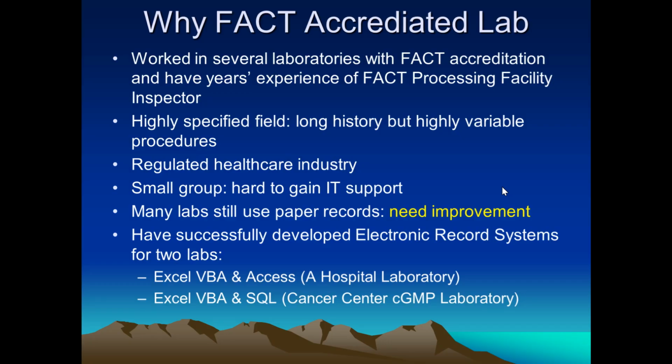I have worked in several laboratories with FACT accreditation and also have years of experience as a FACT processing facility inspector, so I understand the FACT regulations.